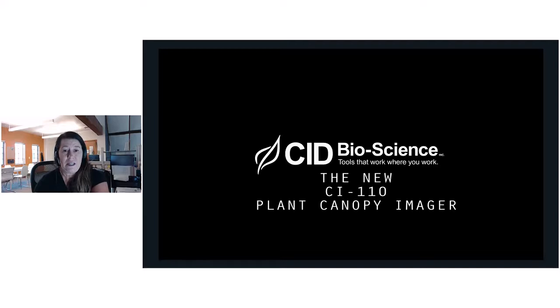Today we are going to be demonstrating the new CI-110 plant canopy imager. We have made a plant canopy imager for a number of years, but redesigned our imager to make it more user-friendly. The new design is an all-in-one ergonomic design. It has an 8-megapixel camera for higher quality images. There's both USB and Wi-Fi for data transfer.